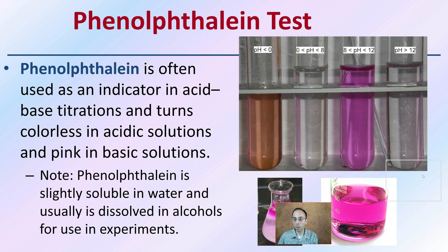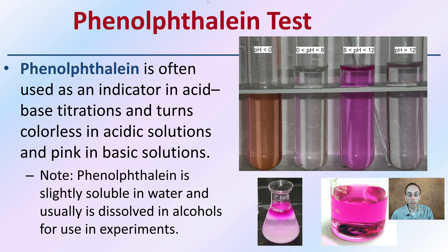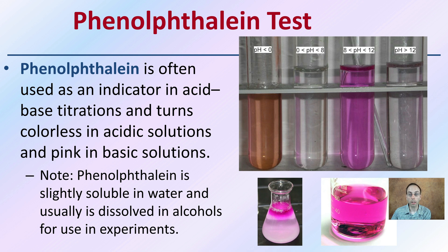The phenolphthalein test produces a nice purple to pink color change. Phenolphthalein is often used as an indicator in acid-base titrations — it is colorless in acidic solutions and pink in basic ones. Note that phenolphthalein is slightly soluble in water and usually dissolves in alcohols. At a pH of 8 to 12 you get that pink coloration, while at a very acidic pH of 0 to 8 it is clear. Above pH 12 the solution can also become clear again. If you add drops and start to see pink, that indicates a base.